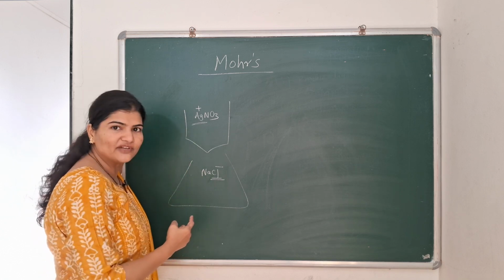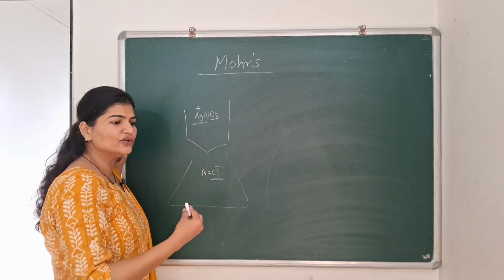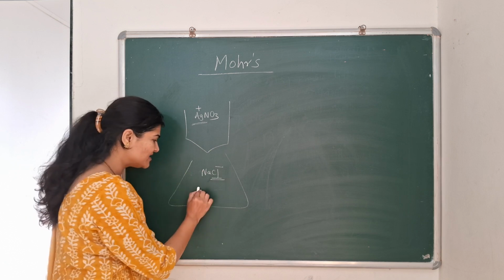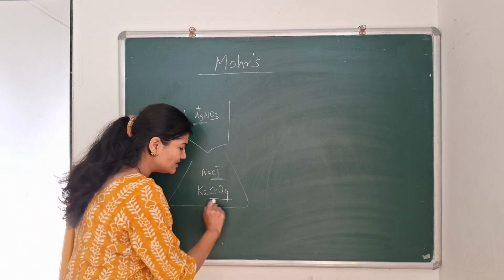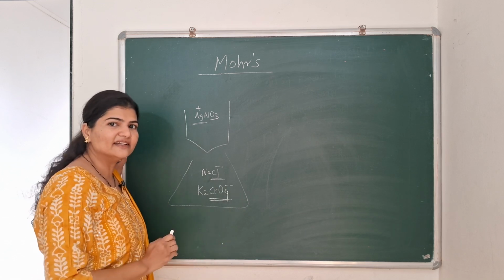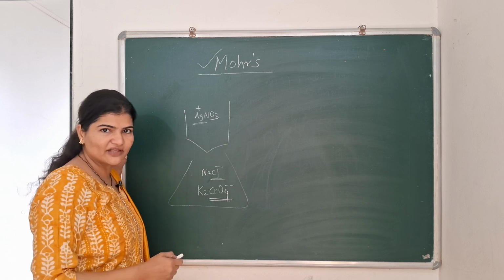Now in this kind of titration, where the halide ion is our analyte and silver nitrate is our titrant, we are going to use a particular indicator. In this case, we will be using dilute potassium chromate solution as our indicator. See here, chromate ions will be behaving as an indicator. So this is an example of a direct titration, and the method is referred to as Mohr's method.